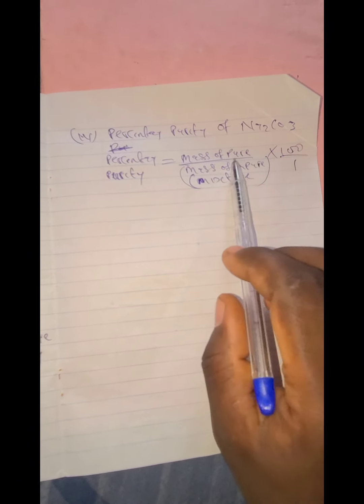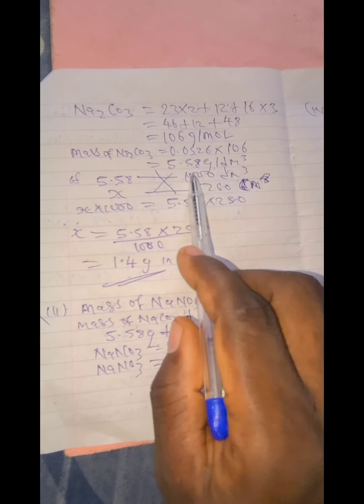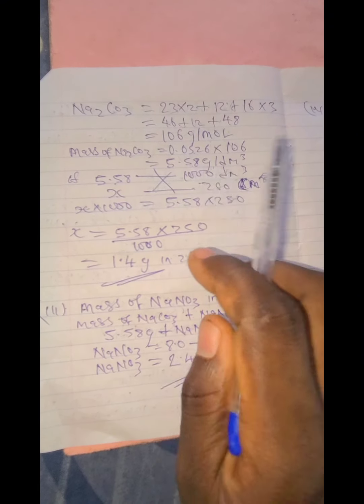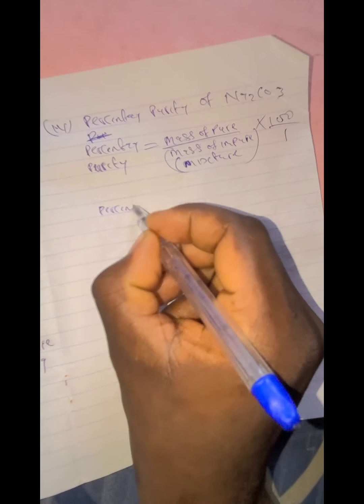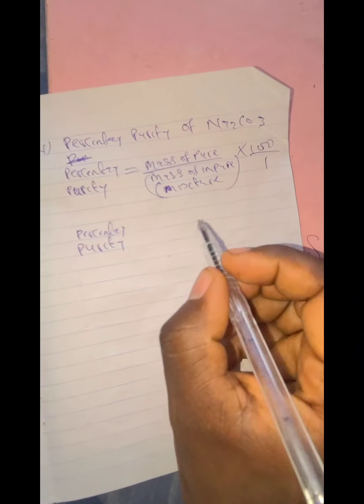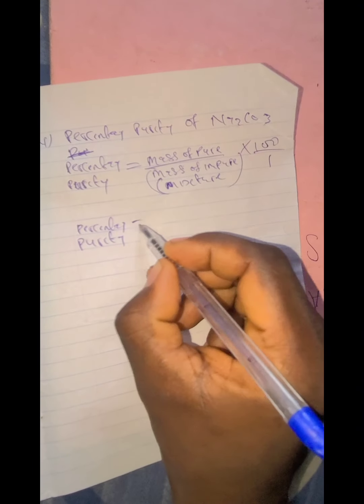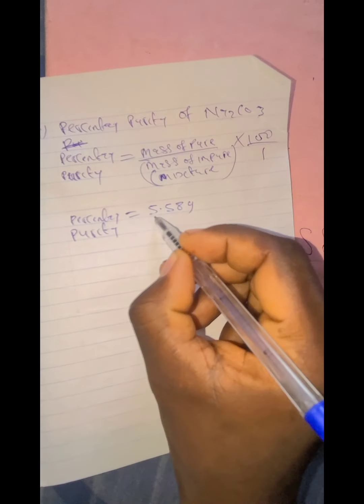So what is the mass of our pure? Just get the mass of this Na2CO3. Okay, and we have our mass of Na2CO3 to be 5.58 gram. So percentage purity is equals to 5.58 gram over mass of impure.